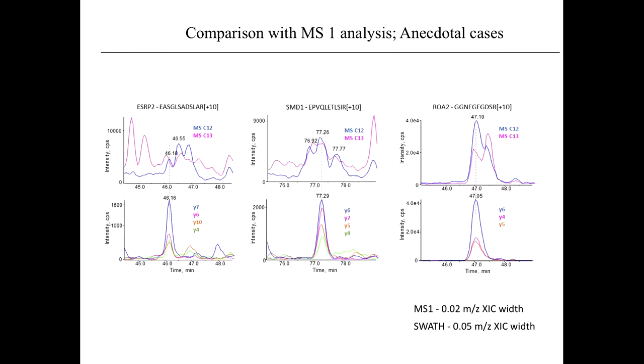So now also, just as a side note, when we generate this DIA SWATH data, we have the ability to compare the detectability and quantification between measurement at the MS2 level, basically by the integration of the peak areas of transitions, as you learned this week, and by following the same peptide at the precursor level.